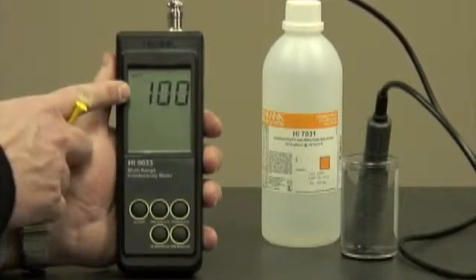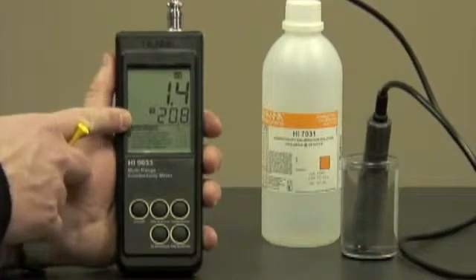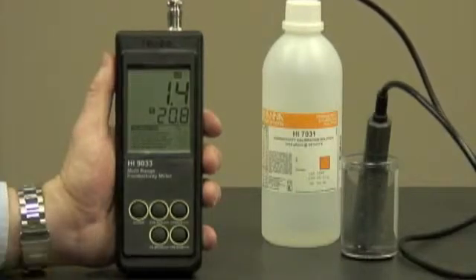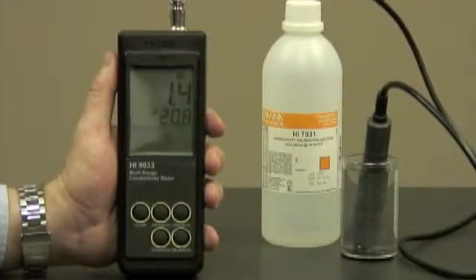you'll see the battery percentage level, the conductivity reading, temperature, and some handy instructions at the bottom. We're going to be using the HI7031 conductivity calibration solution at 1413 microsiemens. This comes in a variety of sizes, from sachets to one-gallon bottles, and standards are available ranging from 84 microsiemens to 111.8 millisiemens.